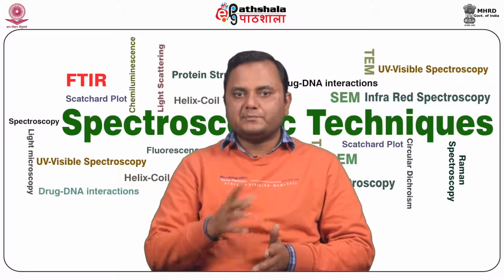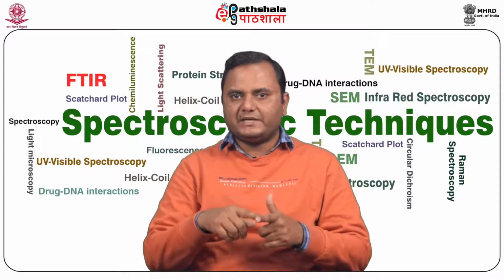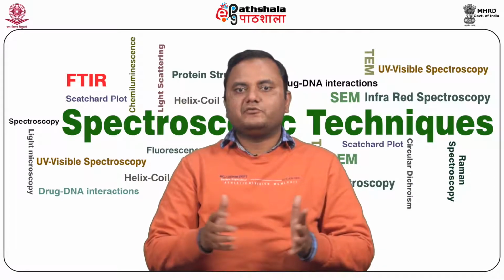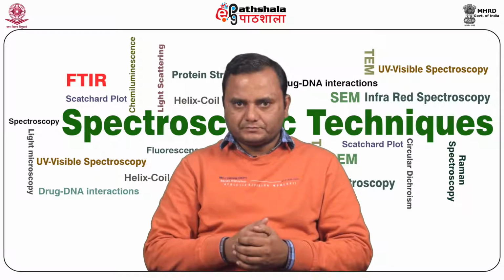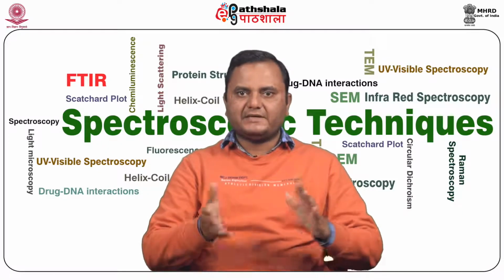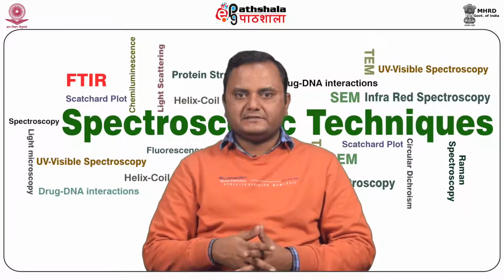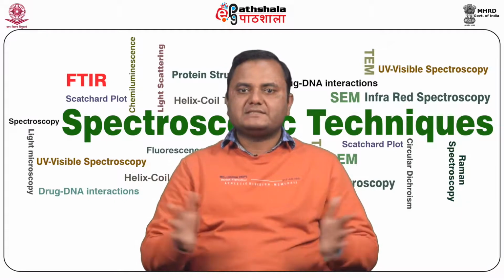However, a circularly polarized light beam results from the sum of two perpendicular plane polarized light beams dephased by 1/4 wavelength, or pi by 2. When a plane polarized light beam has one of its circular components, left or right, differentially absorbed by a dichroic sample, it results in an elliptically polarized light beam.